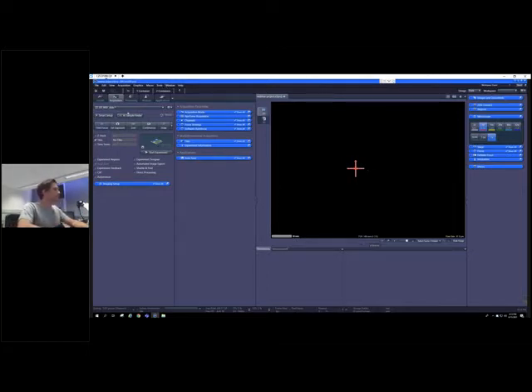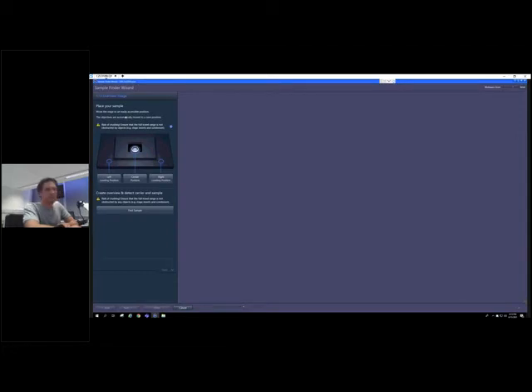So the sample finder is basically a single button click away. You can find it in your acquisition tab, and with a single click, just get started into the AI sample finder dialog. To run the AI sample finder, it's basically just another single click to start the whole process of the different illumination techniques Gerd introduced to you. Plus, there's an additional feature we introduced, and that's loading positions.